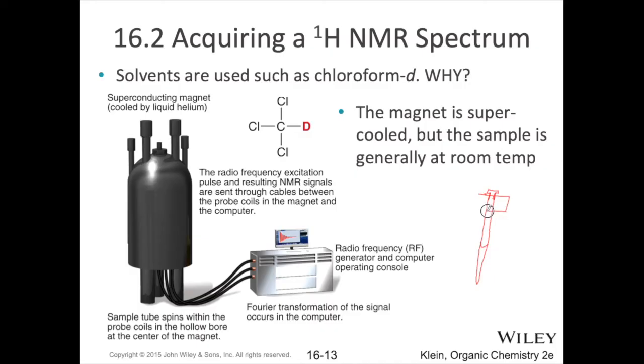You have this little plastic collar that you insert the tube into, and the neck of this collar has little magnetic dots on it, very weak ones, and by having a small little electromagnet in here that turns on and off, it allows this to spin. Again, this is a very weak magnetic field. It doesn't really interfere with the signal from your actual NMR data, so don't worry about that. Basically, it causes the sample to spin inside the NMR machine.